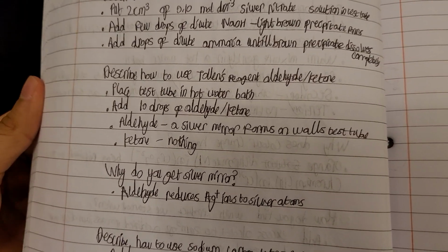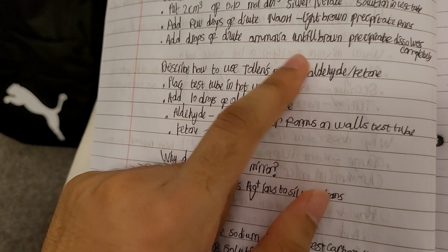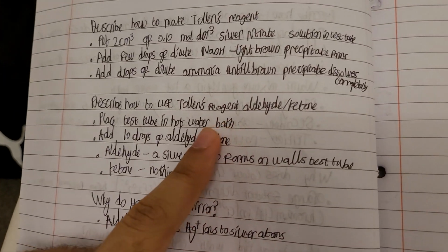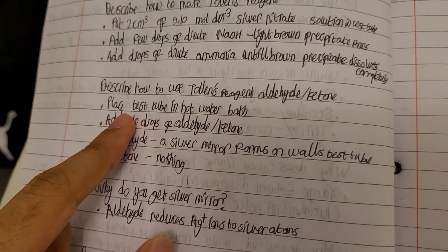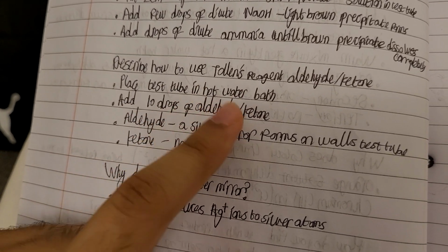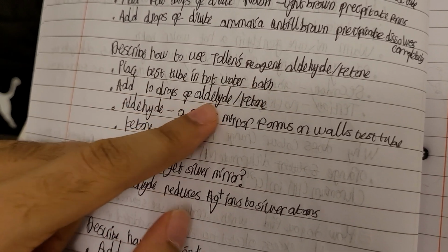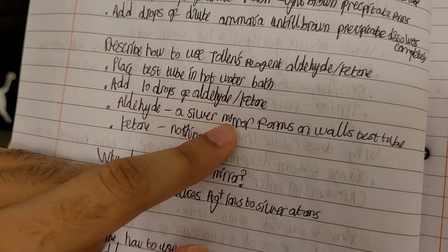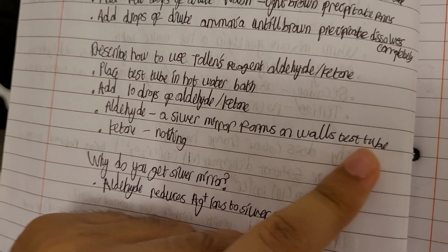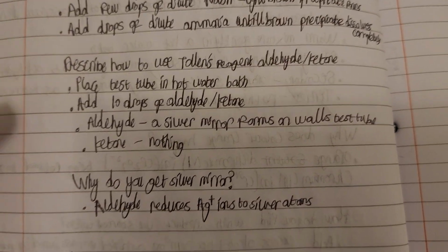Describe how to use Tollens' reagent to distinguish between an aldehyde and a ketone. I probably should have written "to distinguish", but you get the point, hopefully. Place the test tube in a hot water bath and add 10 drops of the aldehyde or ketone, whichever one we're trying to identify. That's it. If it's an aldehyde, a silver mirror forms on the walls of the test tube. If it's a ketone, nothing happens, no color change, nothing.